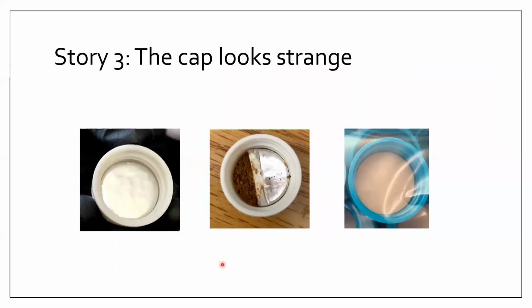Okay, and you also want to mind the lid that you are using. If you are using a small glass vial that holds 20 ml, the one in one of the drawers, make sure you use a Teflon lid, because the lid that comes with it is pretty much garbage. It can only hold water, and it has a cloth-like wooden lining. It is bad if your solvent dissolves that lining. And guess what? We are doing mass spec experiments, and mass spec will see it. The worst scenario is that it might coat the instrument and shorten the instrument life.